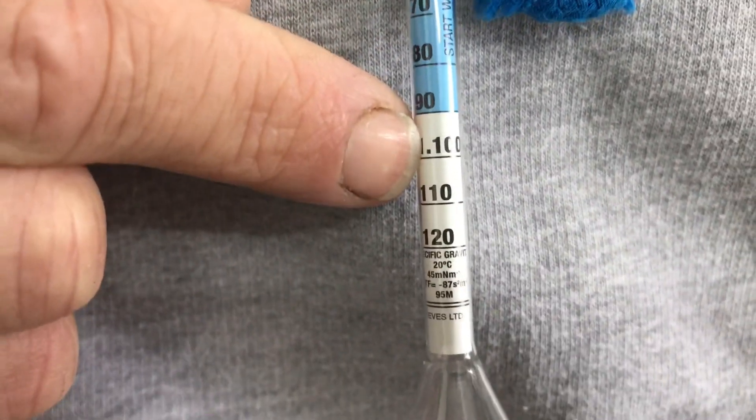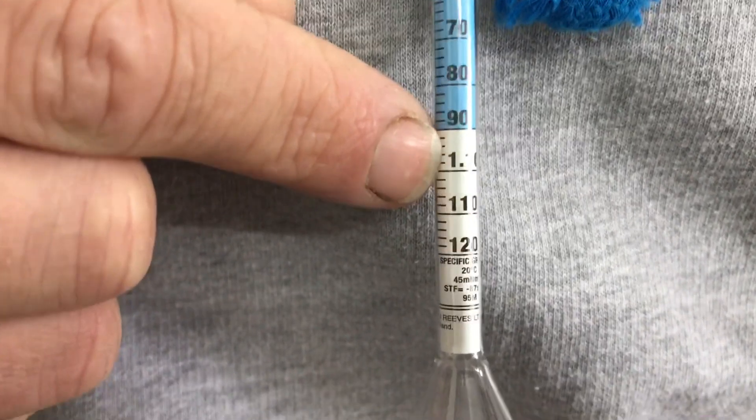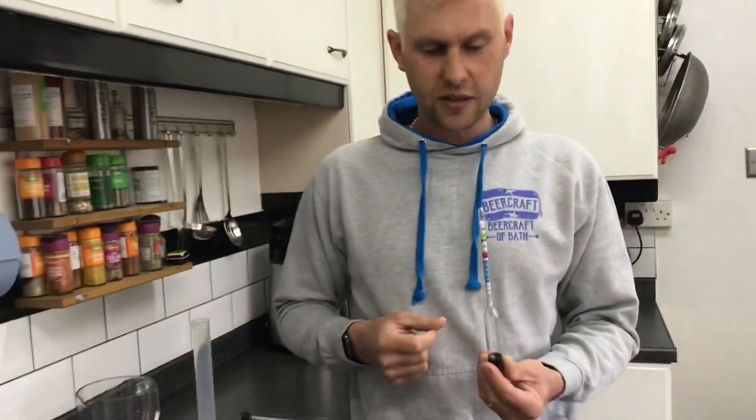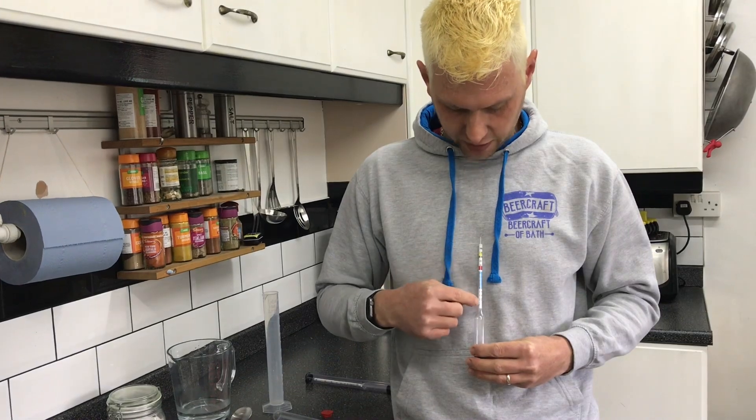All the way up until we get to 1.100. This is what's called the specific gravity. If you ever contact us and say you don't know if your wine or beer is fermenting, one of the first questions we're going to ask is have you tested it with a hydrometer — and then we'll ask what the reading is. This specific gravity scale is the reading we're looking for.